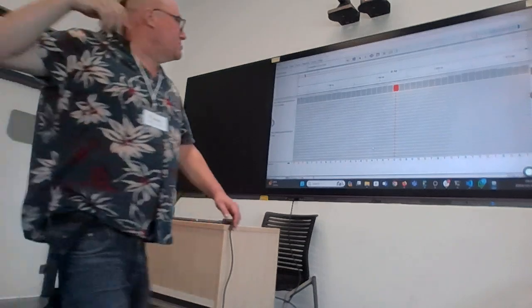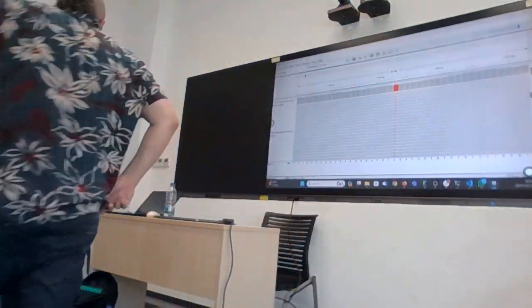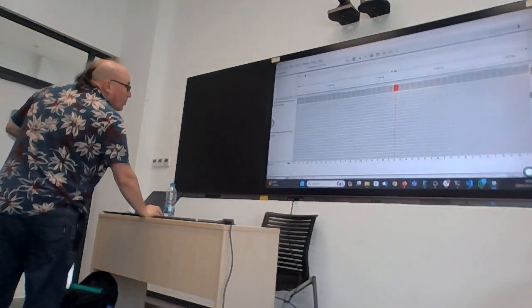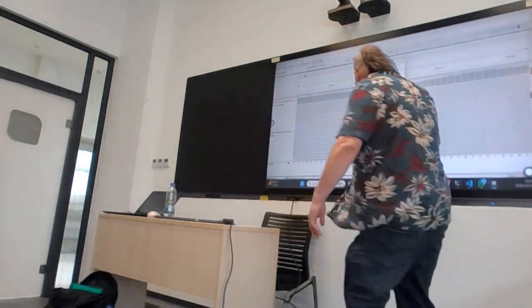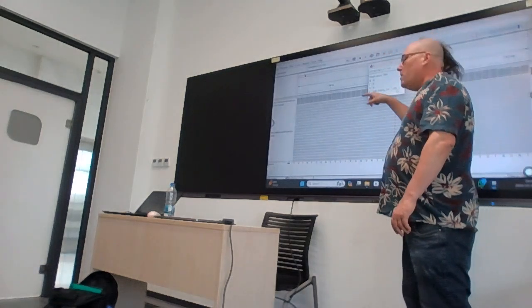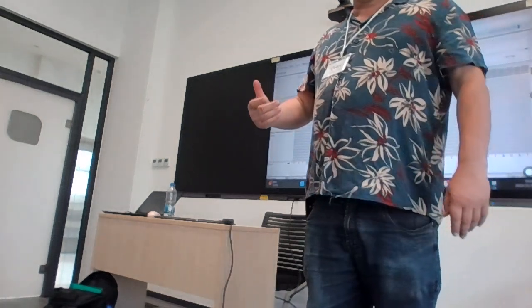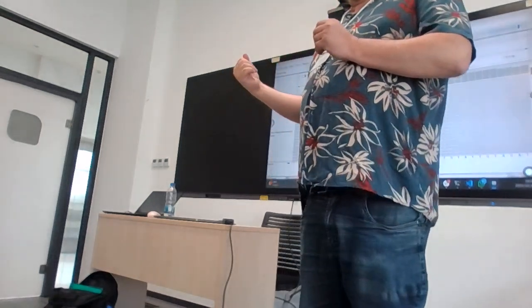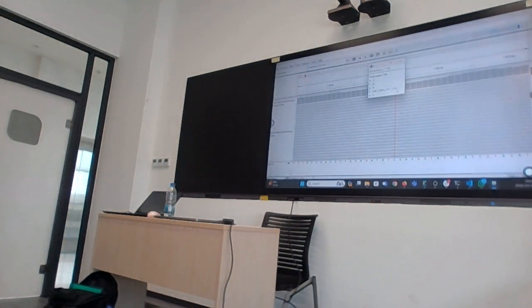And look at here. It's almost all red, okay? So the reference is a C, but it is a T, 200 reads, 100%. Okay? That's why the quality is so high. So for sure, we accept this variant. I need to go back to the authors and ask why the other variant was included, because it was only 63%. I'm going to find out why that is.